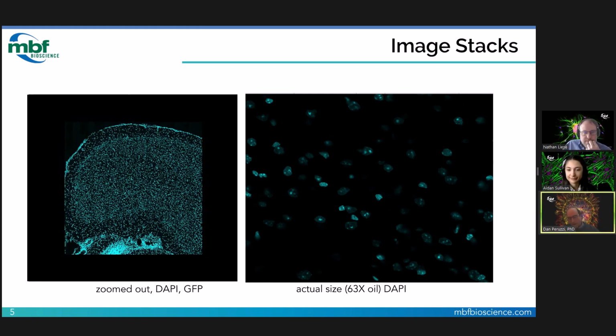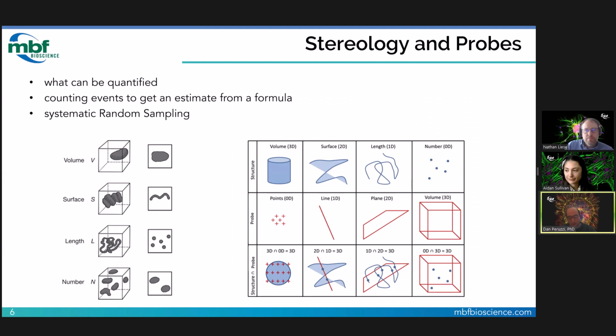Okay, that is very good staining, and we are going to be able to see those cells. So you're kind of way ahead of the game there.